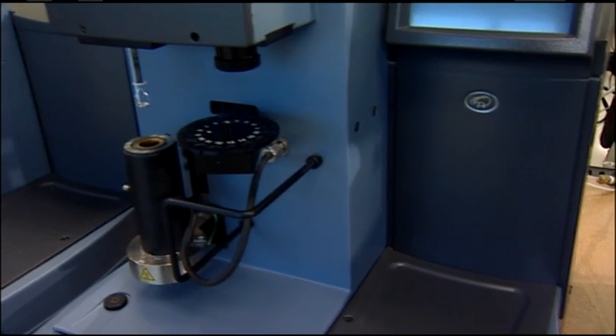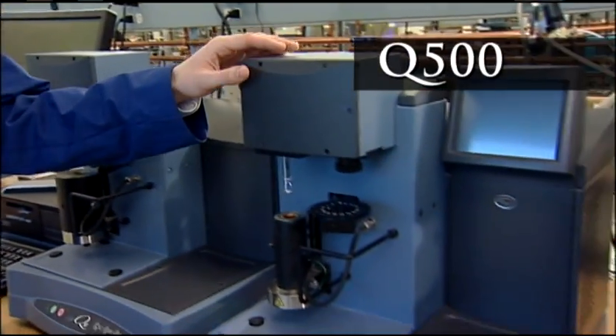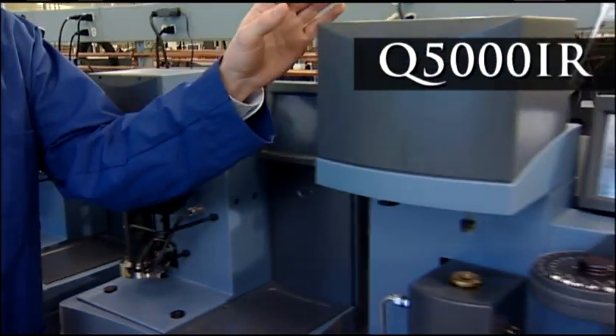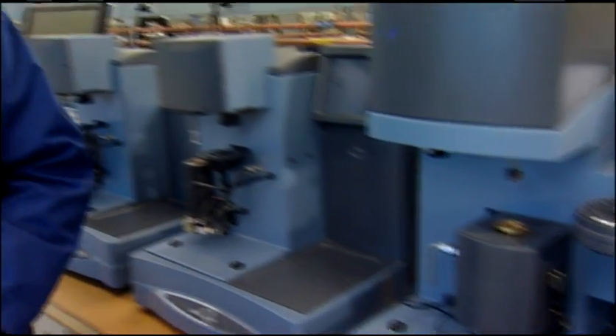All TA Instruments TGAs are designed and built with quality, accuracy, and ease of use in mind. From the entry-level Q50 through the research-grade Q500 up to the industry-leading Q5000 IR, all feature proprietary technology which provides unmatched sensitivity and accuracy, without the need for baseline subtraction, ever.